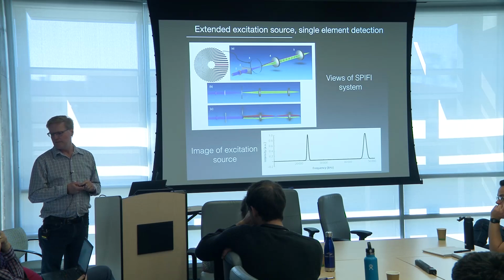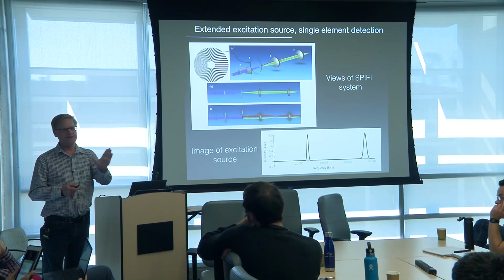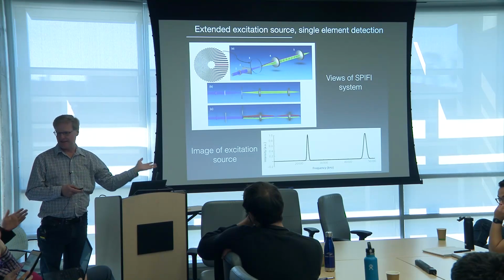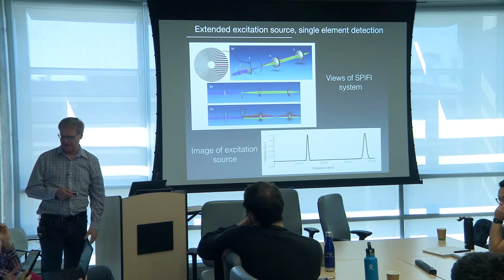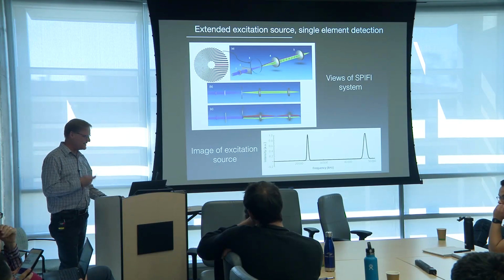Fundamentally, is this equivalent to doing structured illumination in the temporal domain? Yeah, basically it is. We're sweeping our space, but we don't have to take three sets of data and do that. It's there. We're sweeping continuously. Yeah, that's right. And we got a nice point detection.